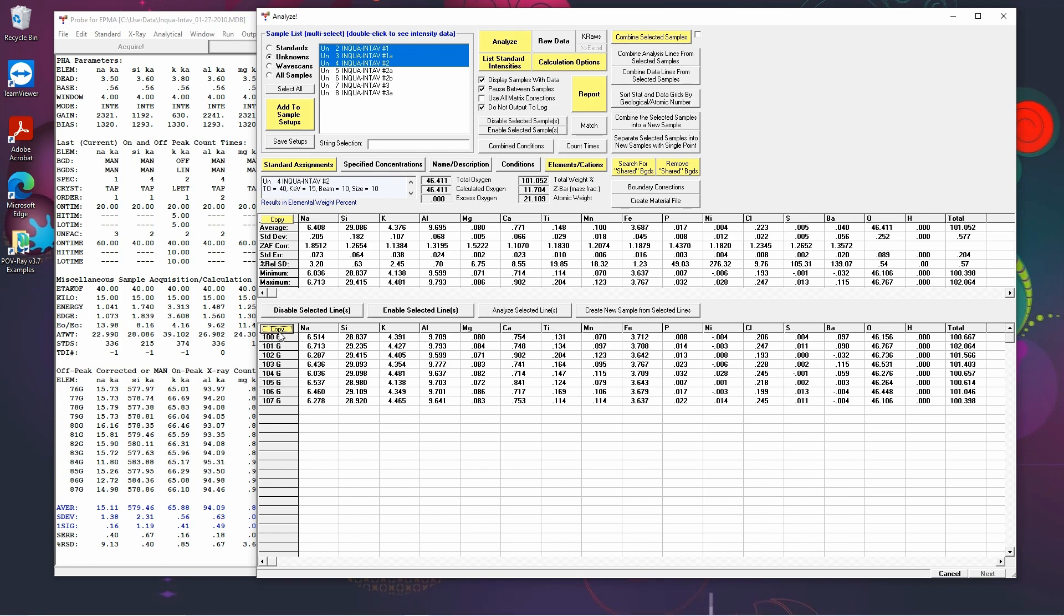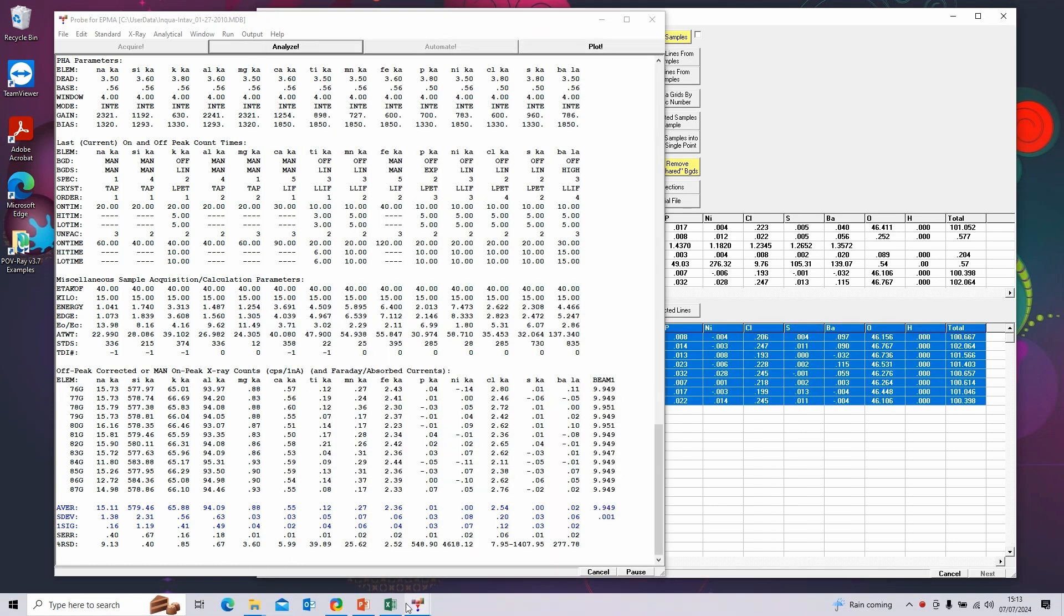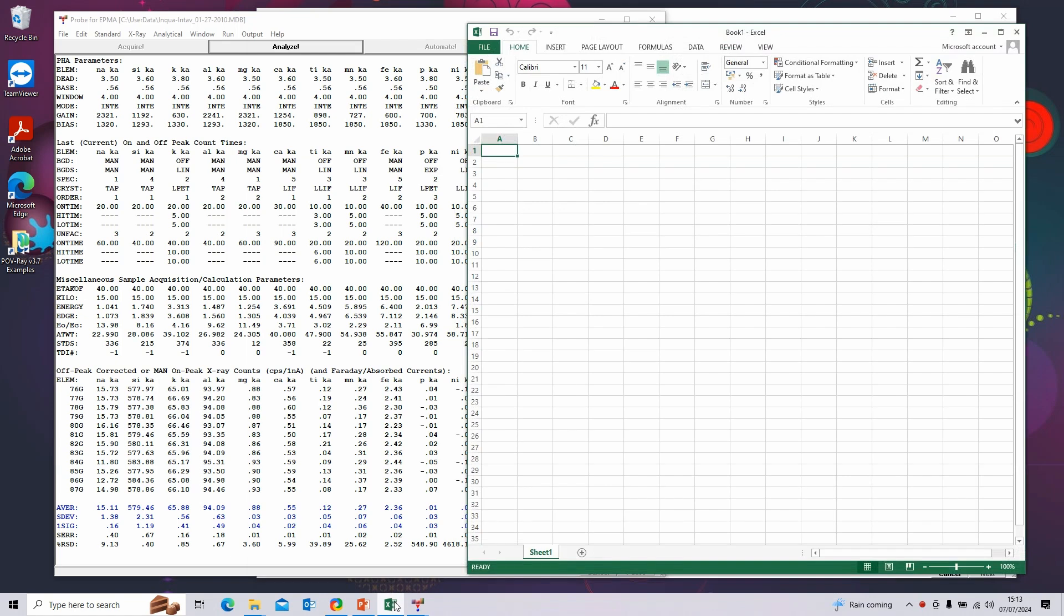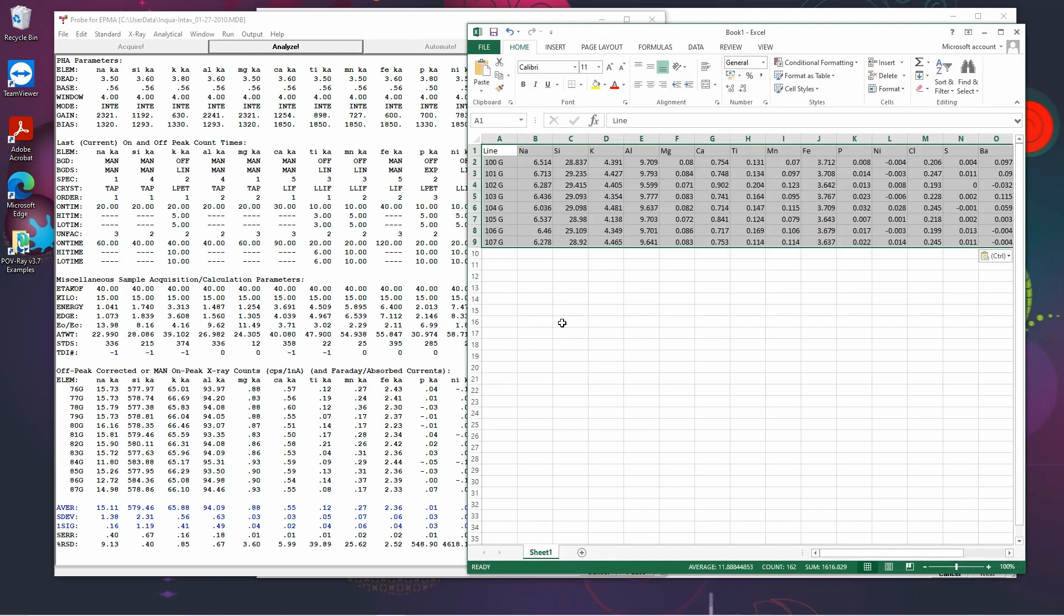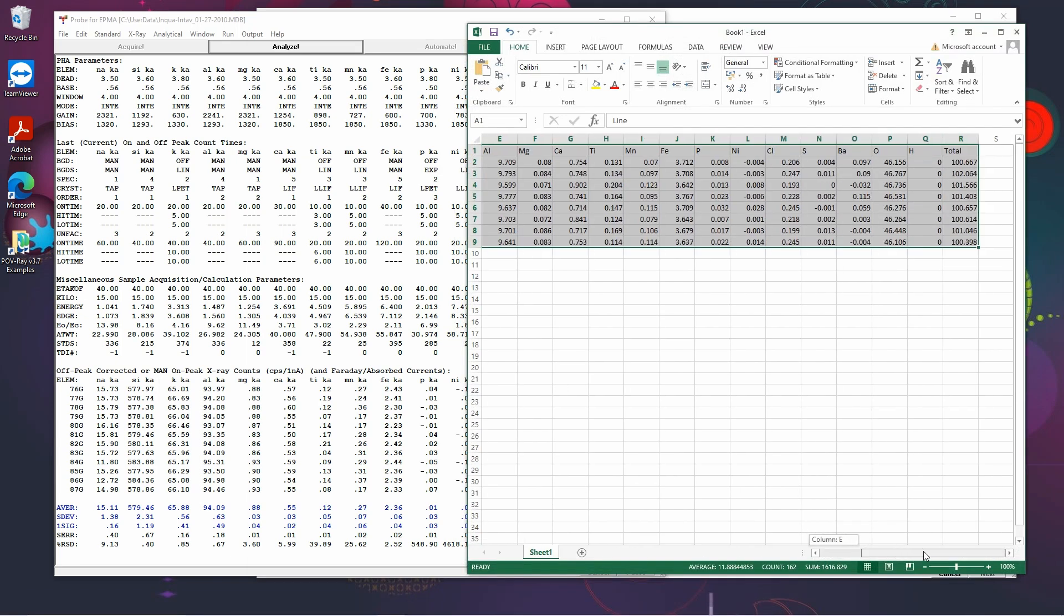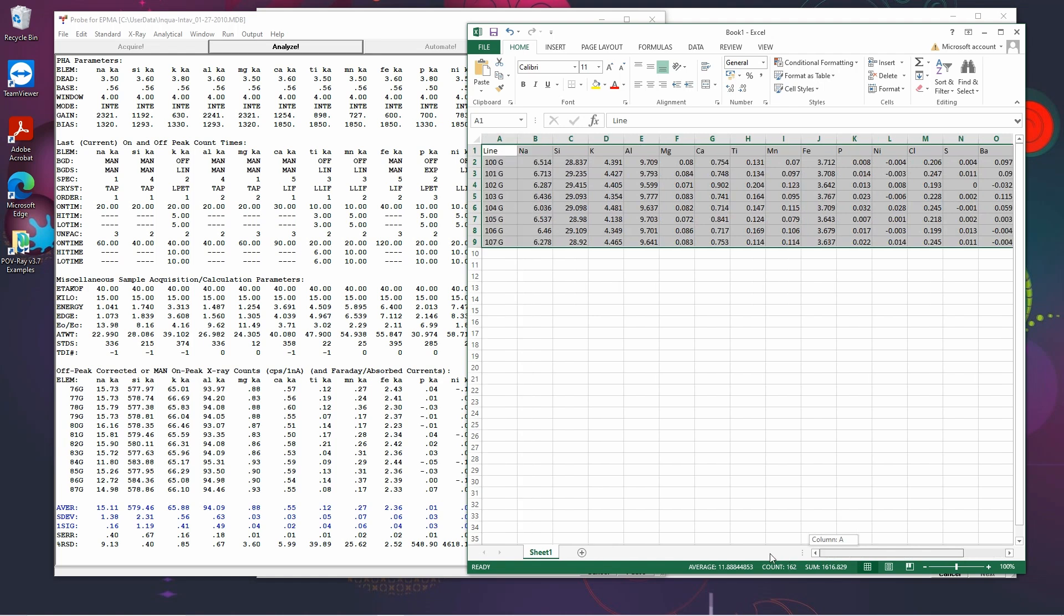We can click on this and this copies the data to the clipboard so we can open a blank spreadsheet and paste the data in. This gives us all our data points as shown in that window.